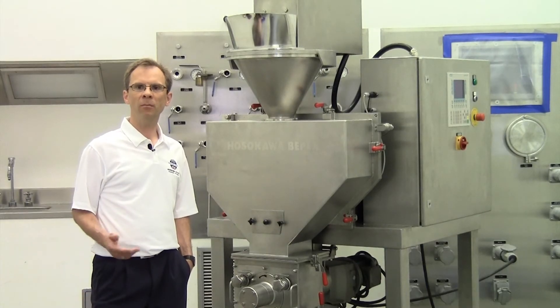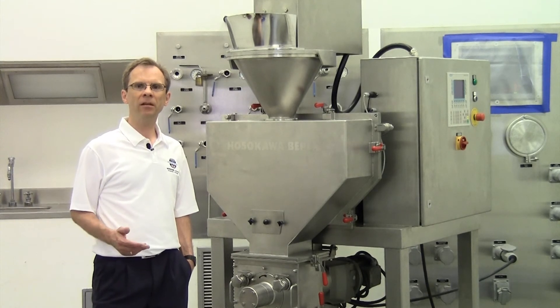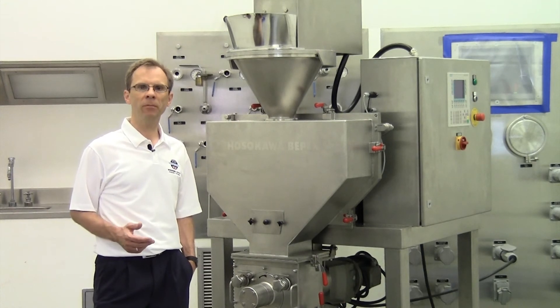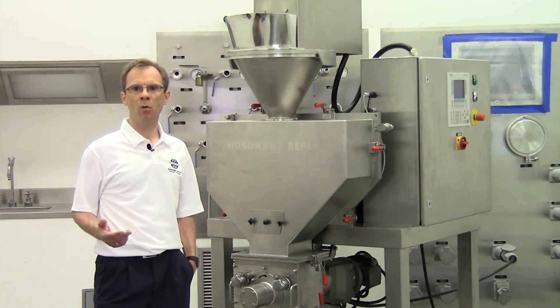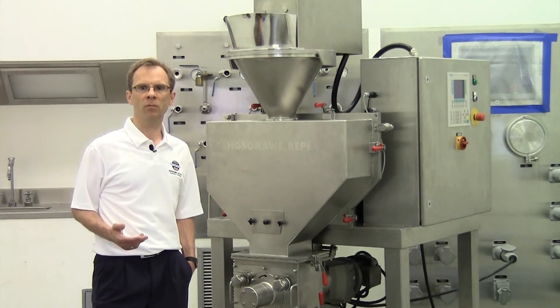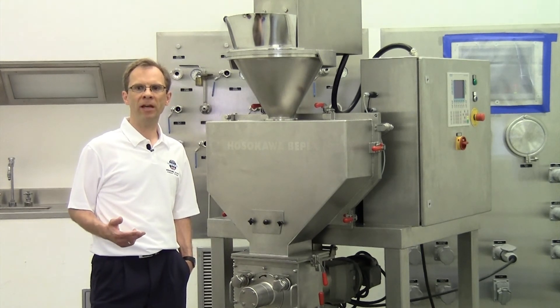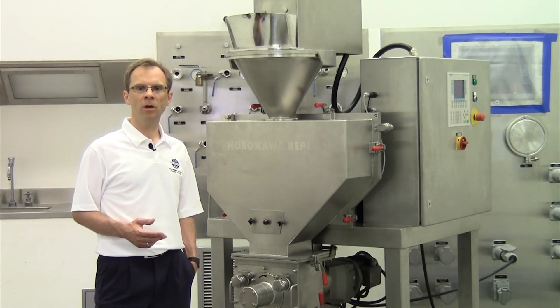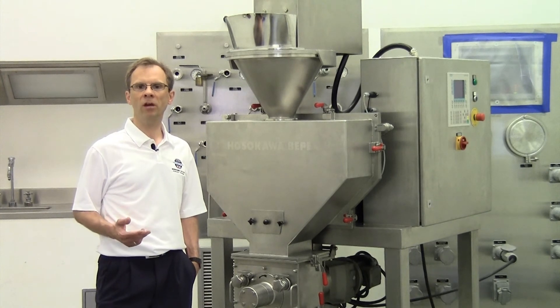Hosokawa designs and manufactures a complete line of dry roller compaction equipment used for chemical, mineral, pharmaceutical, and cosmetical applications. We have small laboratory scale compactors up to large industrial processing systems capable of compaction up to 240,000 pounds per hour. We build machines in mild steel and stainless steel, with or without hydraulic systems, in normal, dust-tight, or gas-tight executions.